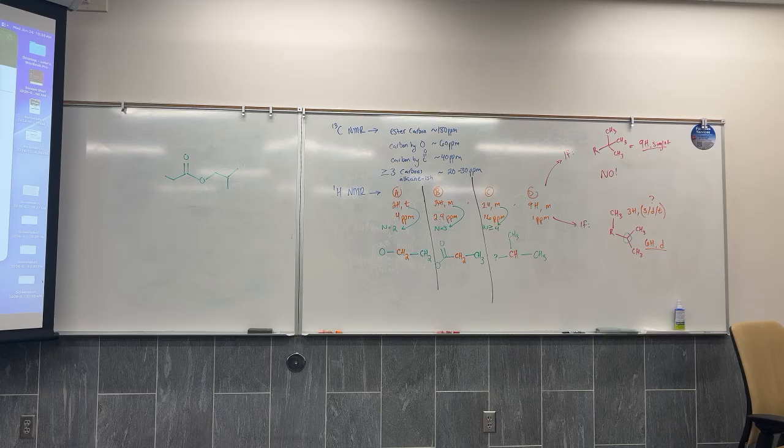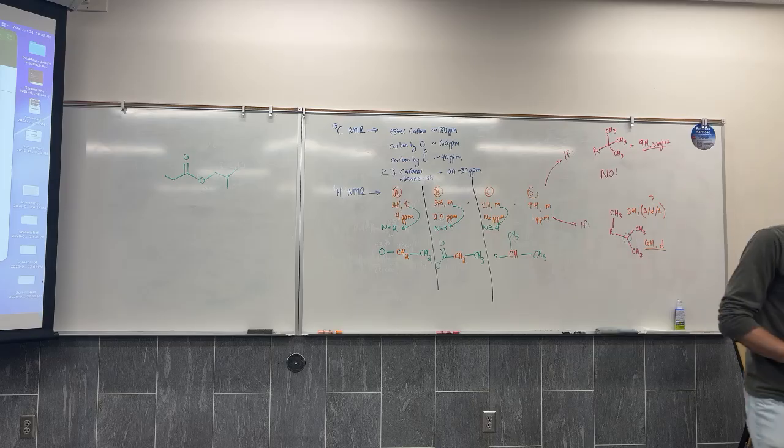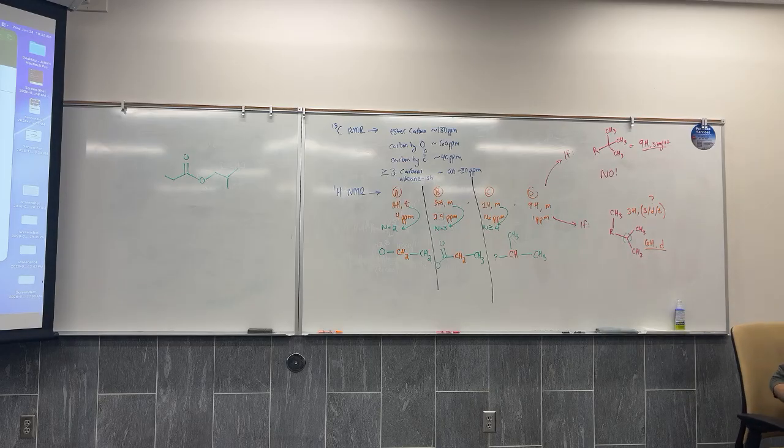Also the PLO has a mistake like that. Remember, the PLO is not my assignment, but the PLO has a mistake like that where one of the integrations is wrong. Another one on the PLO where the integration is just missing. I would say that is the challenge about taking real data, is that if I just make a mistake when I put in a number, it can't really be solved true to that. Okay, we need to figure out what this structure is then.